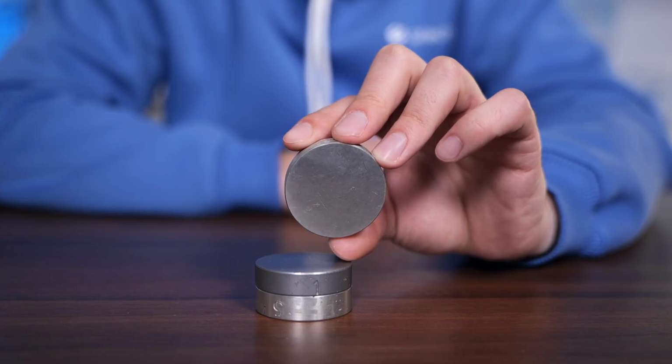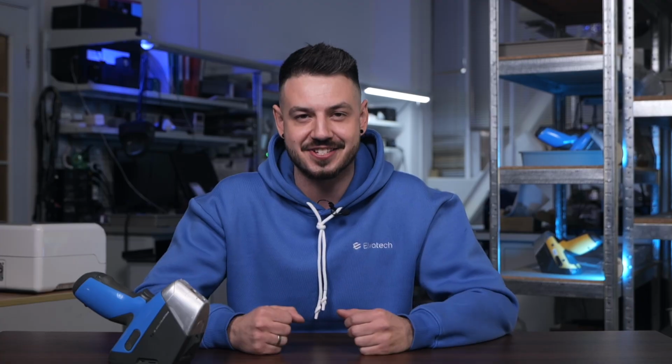Before starting the analysis, make sure your sample surface is clean and even. Dust or debris can cause inaccurate readings. Choose the correct mode for your material. And if you are unsure, our technical team is always here to help you set up your analyzer. Measure multiple points for complex samples, use the correct calibration, and regularly check your equipment settings.